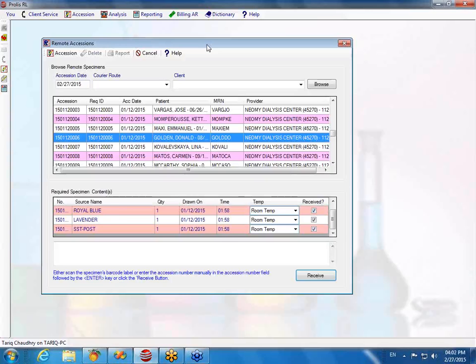Okay. How many analyzers do you support today? We have written the interfaces for more than 125 analyzers. Okay. Good. So is Shimadzu 8040 supported? I don't know the Shimadzu number from the top of my head, but Shimadzu, yes, we have. I remember Shimadzu was written somewhere in the past. And I'm assuming for the chemistry analyzer AU640, almost every second lab has it. Right. But what about Carolina Chemistry? Which one? 720i. Carolina Chemistry?